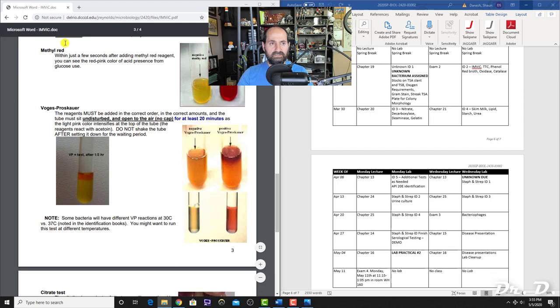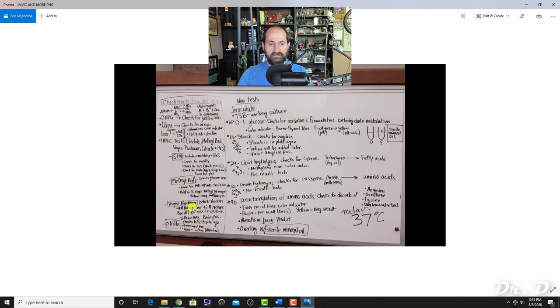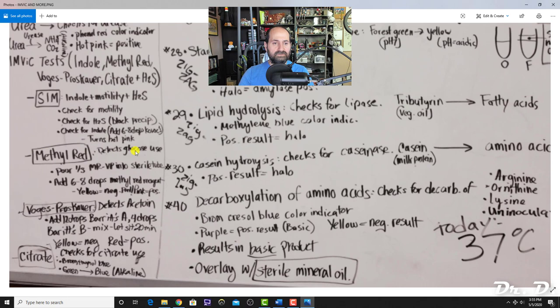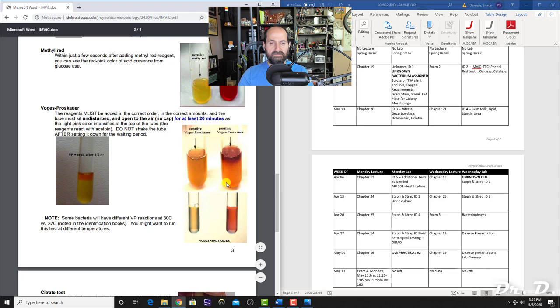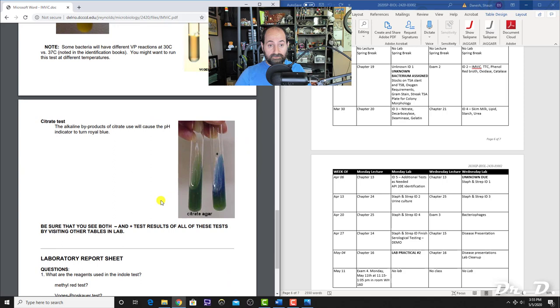The Voges-Proskauer (VP) test detects acetoin. First add 12 drops of Barritt's A, then 4 drops of Barritt's B reagent, mix, and let sit 20 minutes. Yellow is negative; red or pink is positive, meaning acetoin was detected.